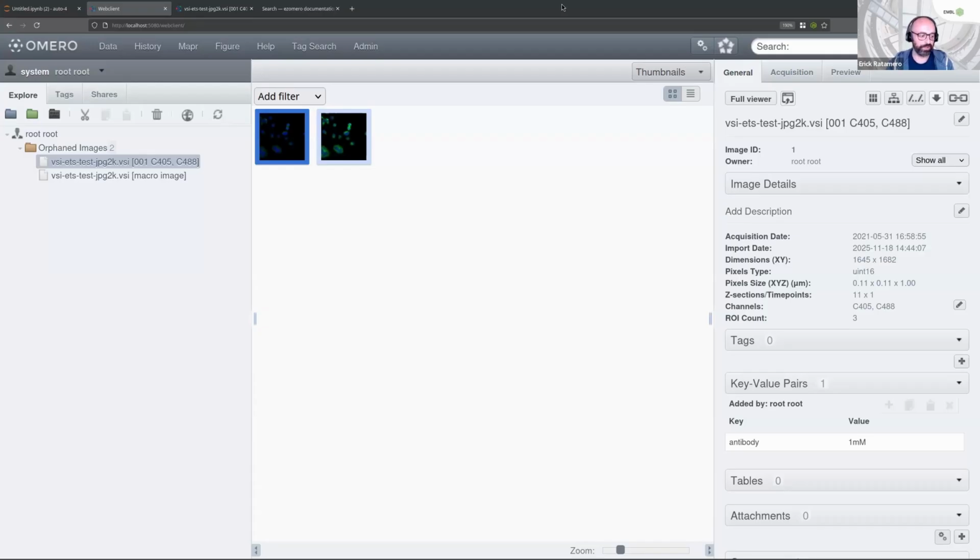It's very robust software. It's been around for a very long time, and it's pretty well secured as far as I know. We do special things when it comes to things that are publicly accessible. Well, when I say we, I mean Kiya. I don't work there anymore. Kiya, do you want to talk a little bit about that?